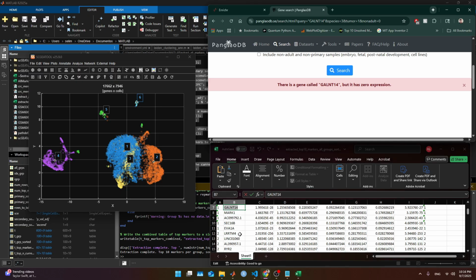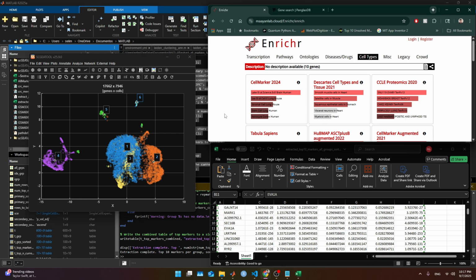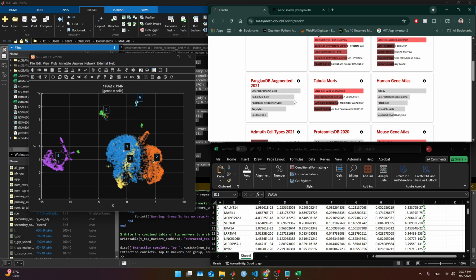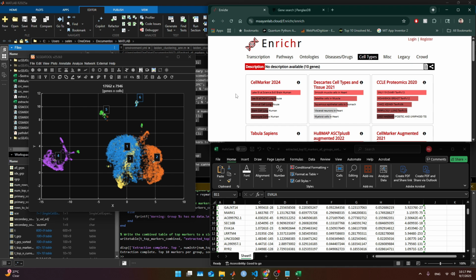Well, nothing came out. From this cluster, we will have to try to make sense from here. Stem cell lung. It's pointing out to something stem cell related. Basal paneth of epithelium proper. Epithelial sounds correct to me. No. So here we didn't get much.